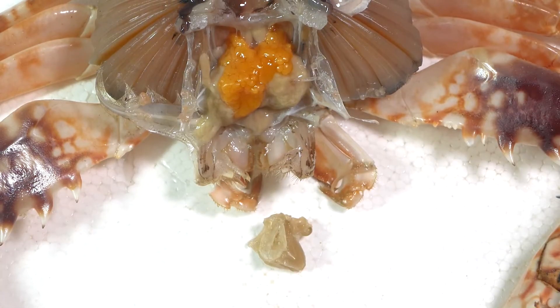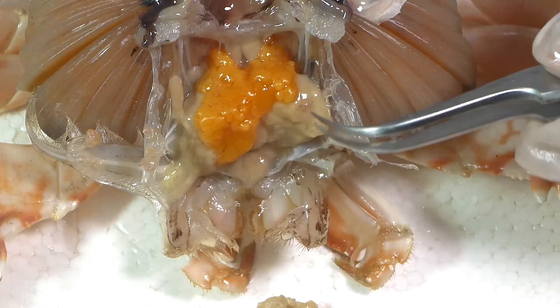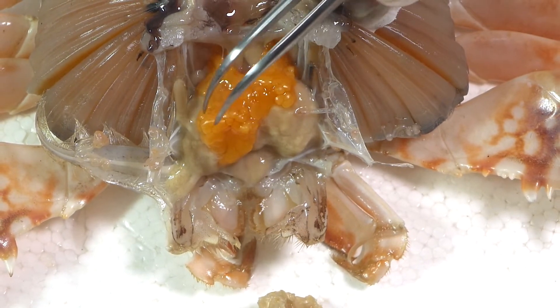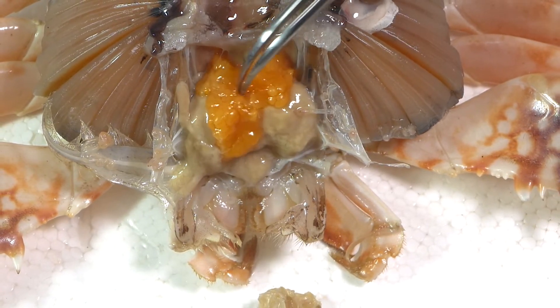The yellowish bulbous material is the digestive gland or digestive cecum. If the gonads are present, they will be anterior to this digestive cecum, right under the edge.